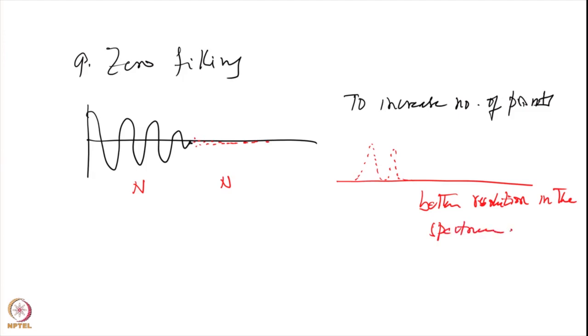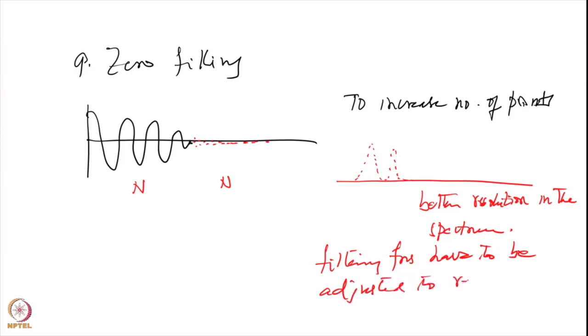And of course when we do this, the filtering functions have to be adjusted to remove the wiggles. Okay, so I think we will stop here and continue with the next class.